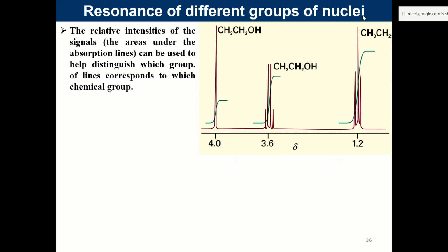Based on that, we found that you are observing CH3 methyl protons at around 1.2. You are observing methylene, and hydroxyl. That's how you say. ठीक है ना? मिथाइलिन समझ में आ रहा है? CH2 प्रोटॉन्स को मिथाइलिन कहेंगे, उसको मिथाइल कहेंगे. And this is the hydroxyl proton.